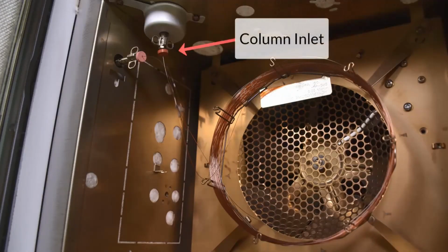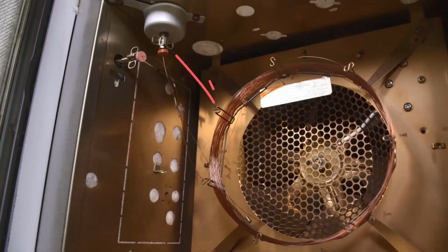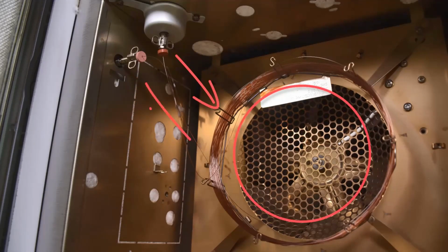Here is the sample inlet. This is where the sample is introduced to the column. Here is the sample outlet. This is where the sample moves from the column to the detector. The mobile phase runs from the start of the instrument, through the column, and to the detector.